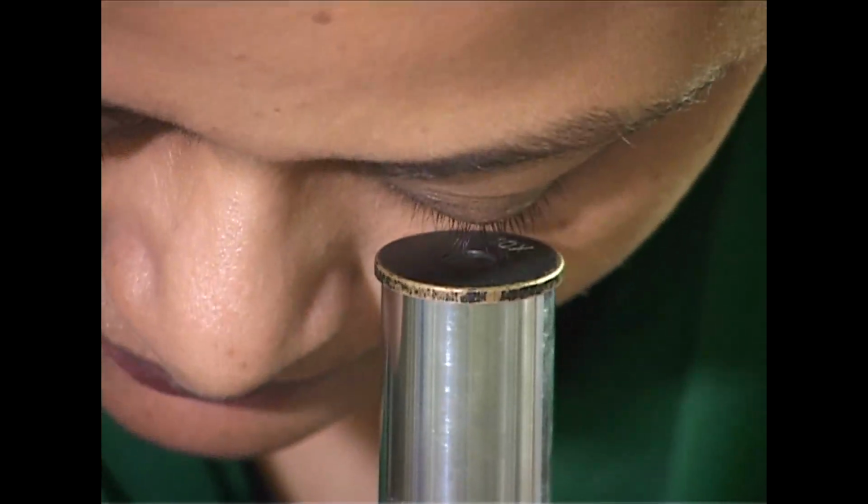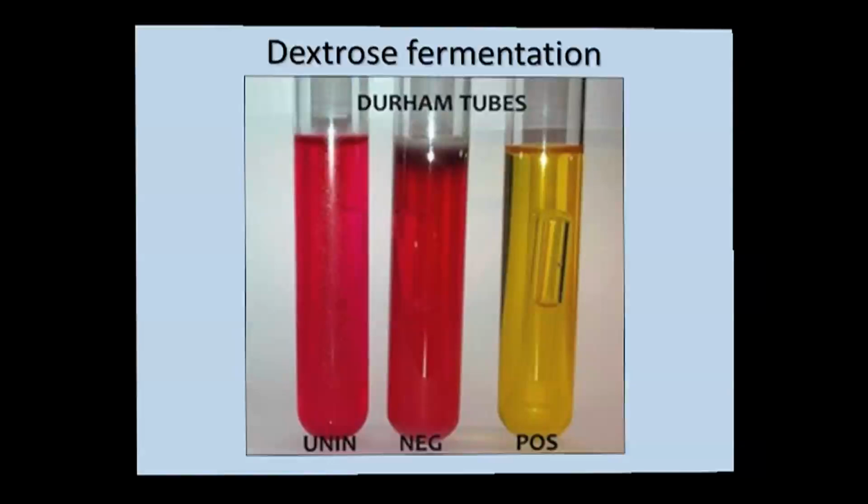If the organism is motile, you will see it directly without any stain under the microscope. Rhizobium species are motile because they have flagella, and by this simple protocol it will be easier to identify Rhizobium.